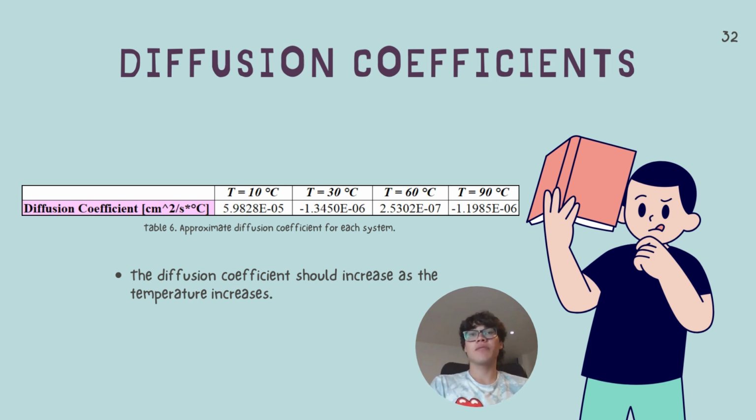We can say from this that these different values are because of the molar absorption coefficient that we used, which was for acetic acid instead of water, or because there were actually a lot of simplifications in this calculus.